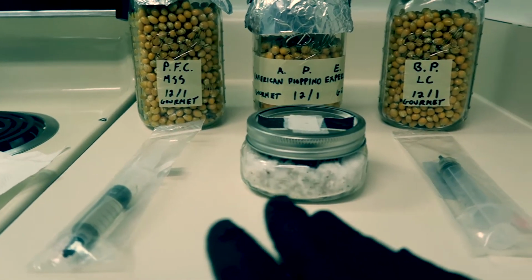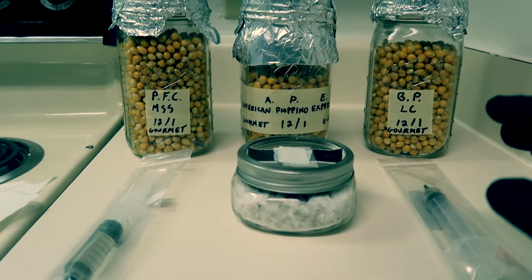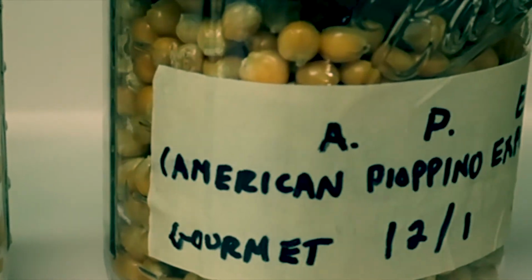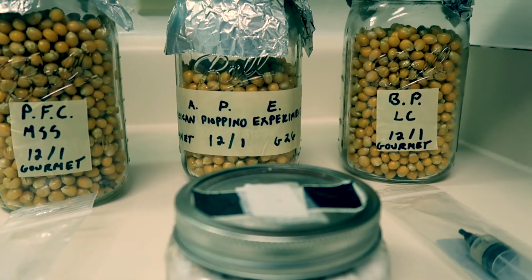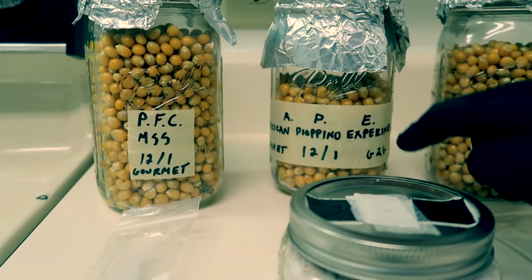Remember to stay clean and organized throughout the whole process, because it's pretty easy to forget what you've inoculated here. So you can see I've got my labels on everything. Just for my own reference, the only thing that really matters is the type of inoculation method for this particular video.